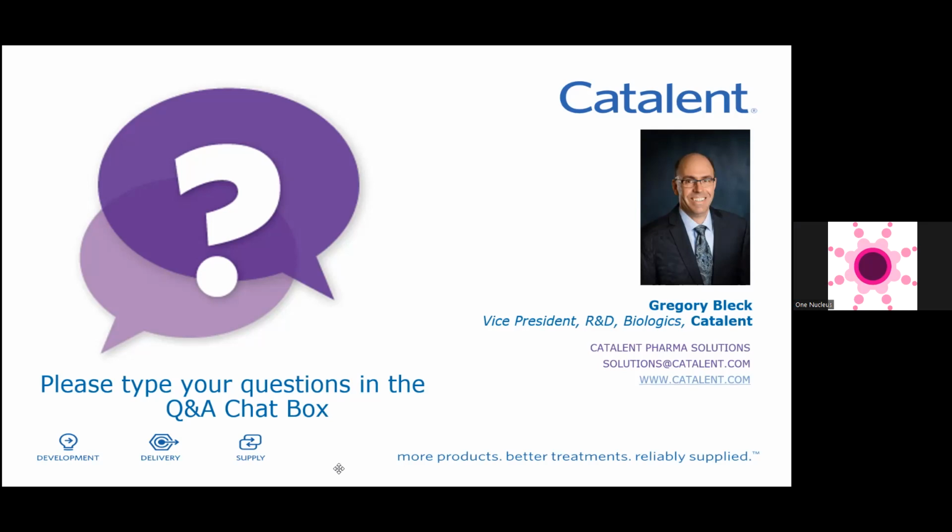Greg, could you elaborate on how GPEx Lightning would be performed for complex molecules such as bi-multispecifics and fusion proteins? Yeah, so one of the really unique things about the technology and the way that recombinase works is that we can flip genes, basically almost titrate genes, into those docks. The base cell line has about 200 dock sequences, so we can express two genes at the same ratio to one another, or at different ratios. And we know that recombinase is going to flip the genes into the stable cell line at whatever ratio we do that original plasmid transfection with.